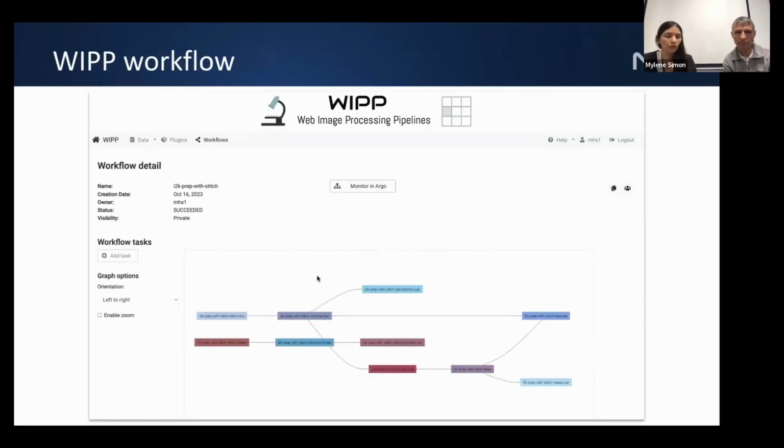Then you will want to create your computational steps in the workflow view. So here we have all of the steps of this workflow. We do some stitching to get all of the positions of the small files in the grid. Then we assemble the bigger field of view. We want to do a pyramid representation of one channel and the other channel. We want to do segmentation. We also want to extract some features. We want to do a pyramid visualization of the mask, and we also want to look at the features from the segmentation.